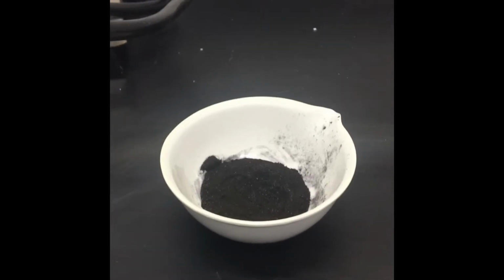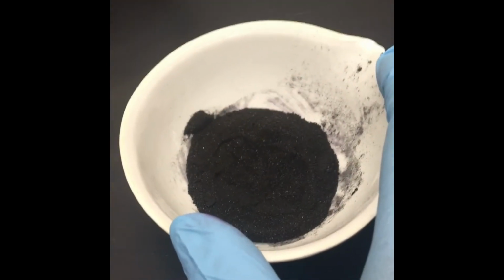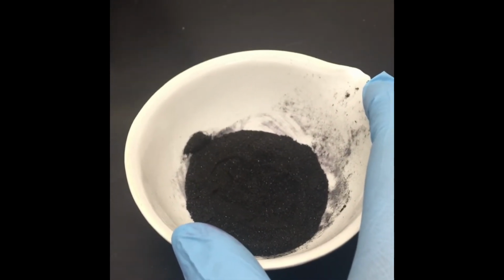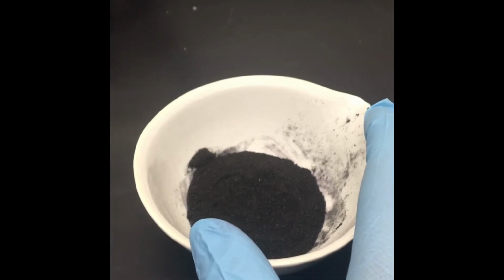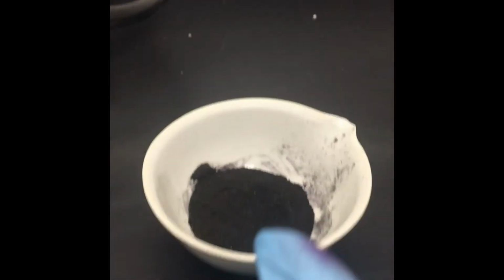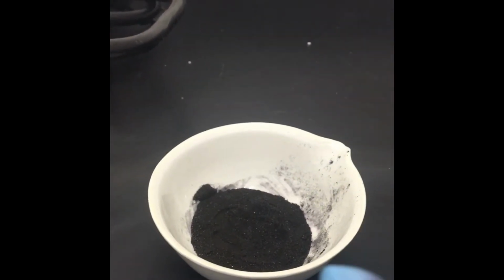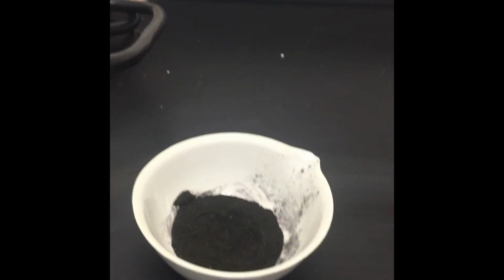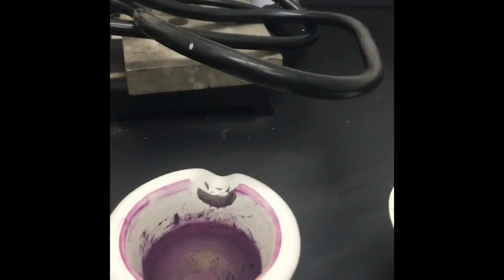So what we have right here is a compound inside this evaporating dish. We have a very fine powder that is called potassium permanganate. This potassium permanganate contains potassium, manganese, and oxygen. A lot of oxygen. Actually, an oxygen molecule is O2, and potassium permanganate has 4 of those, so O4. So a lot of oxygen. And it's very fine. It actually is a powder that I had to grind. So you can see that here I actually use a mortar and a pestle, and I make sure that it's ground very fine.